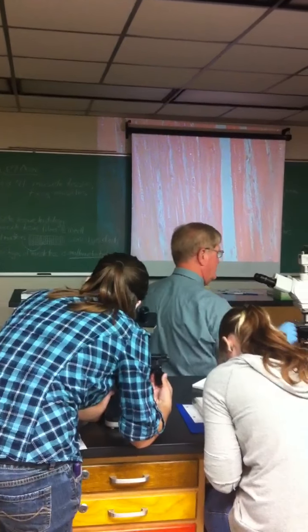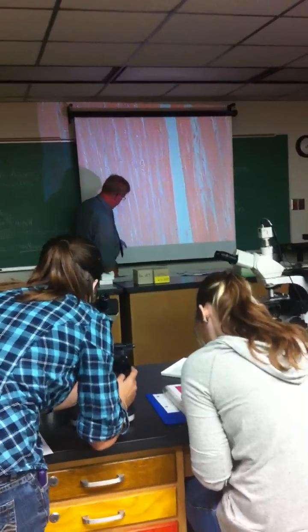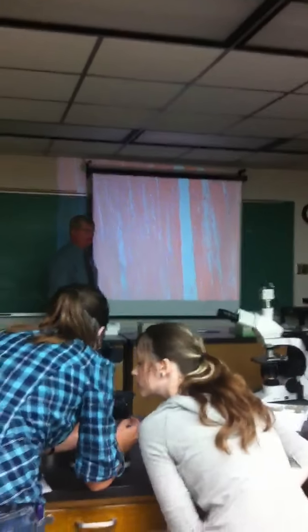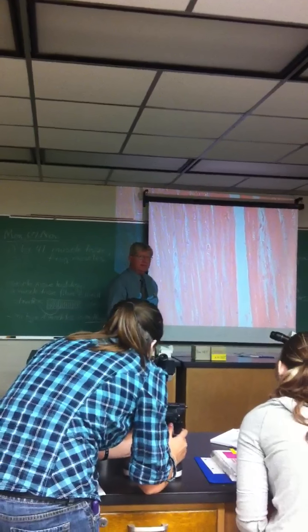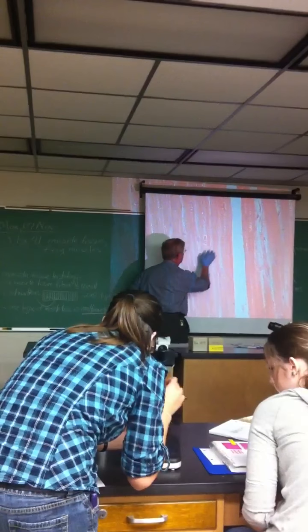Now, can you see nuclei in this view? Yes. Here's one, here's one, here's one, here's one, here's one. Several up here. All right, but in my opinion, you can't figure out whether this is skeletal or cardiac, because you can't see the striations at this point. But look at this cell right here.